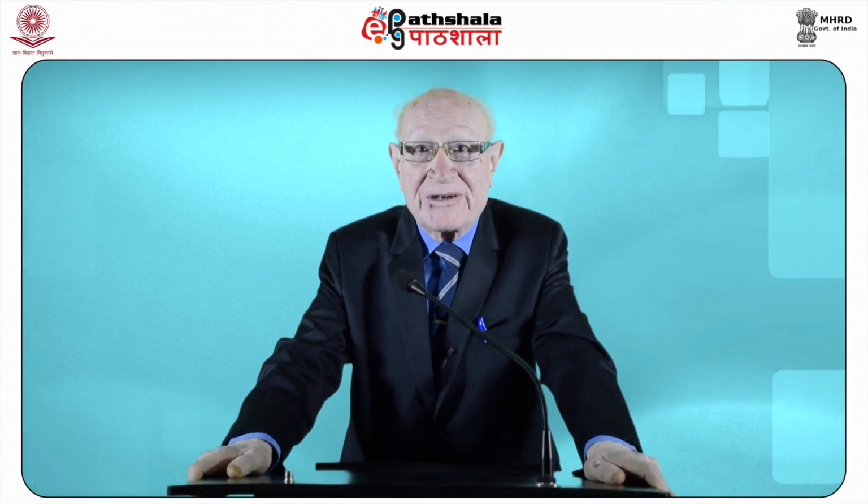The formula is 2d sin theta equals n lambda, where n is 1 in this case, and lambda can be known after we measure the value of angle theta and also know the d of the crystal which deflects the X-rays. The diffraction of X-rays and measurement of theta will give the wavelength of these characteristic X-rays, identifying the element present in the GSR. This method is non-destructive, more useful in forensic science.